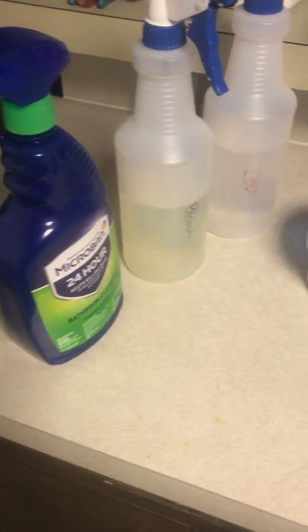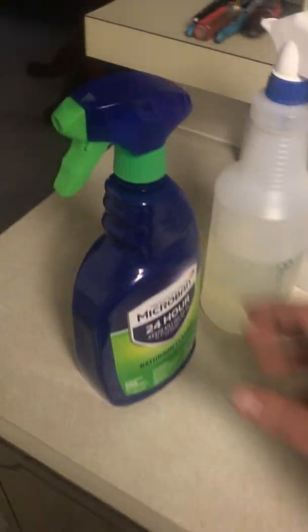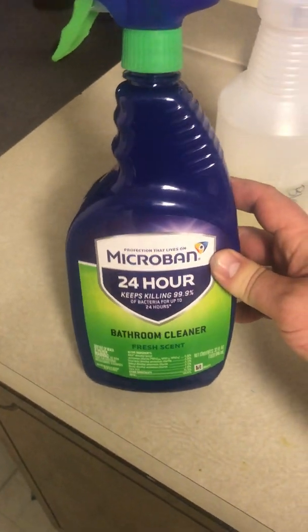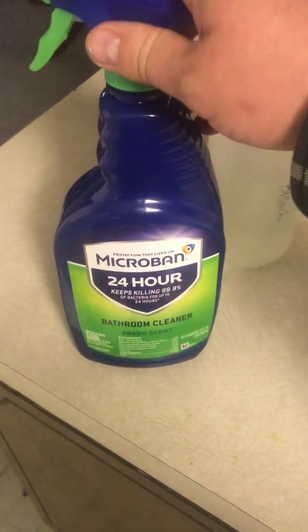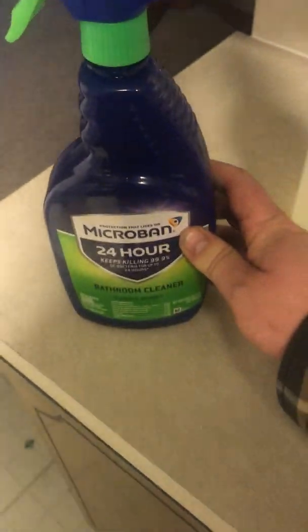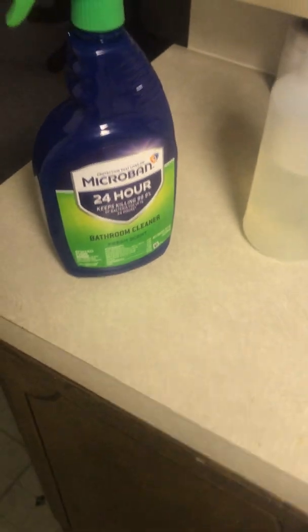The first thing is finding somewhere clean — you want to keep your work area clean. I've recently started using this stuff just to clean countertops before I work. It says that it kills bacteria for up to a day; whether or not that's true I don't know, but it seems to work pretty good.